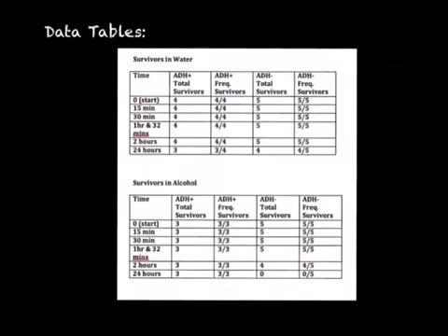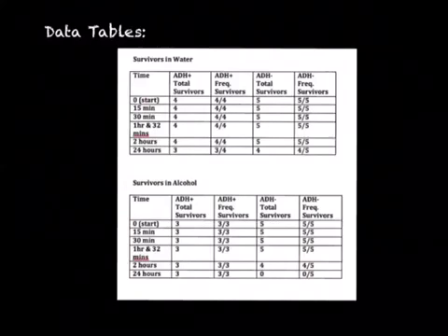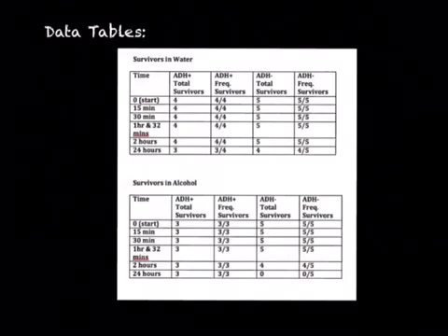Unlike the control group, the experimental group showed differences in their behavior as mentioned before, and we were able to conclude that because of the ADH mutation that the ADH minus flies contain, this reduces the ability of the flies to tolerate alcohol, which led them to an alcohol intolerance.